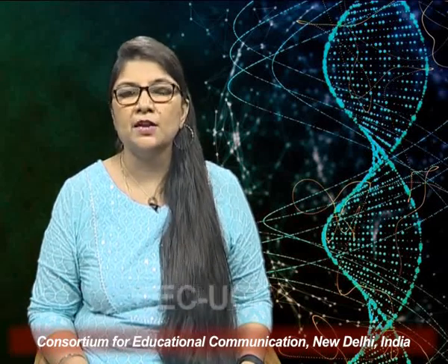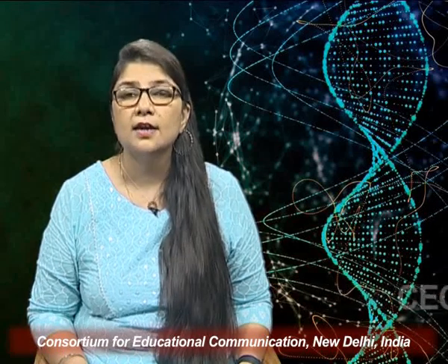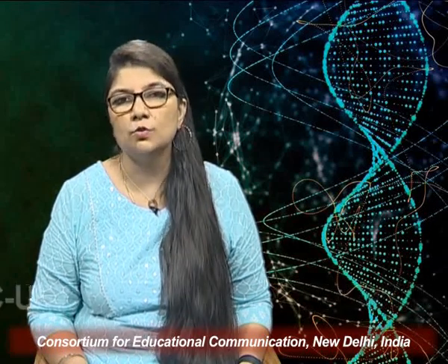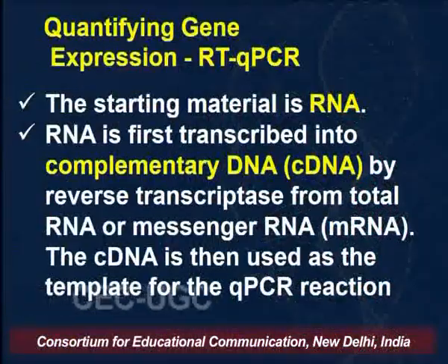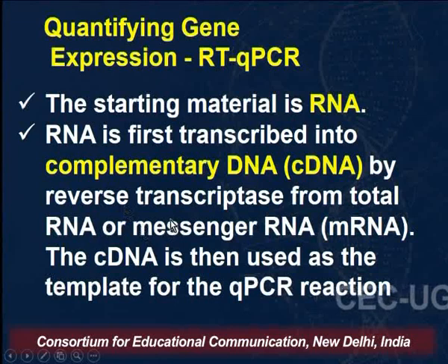It uses an enzyme called reverse transcriptase, and this reverse transcriptase converts the RNA into complementary DNA. So the RNA is first transcribed into complementary DNA by the reverse transcriptase enzyme from total RNA or messenger RNA. This cDNA is then used as the template for the quantitative PCR reaction. So directly RNA is not used. This is a very, very important method.